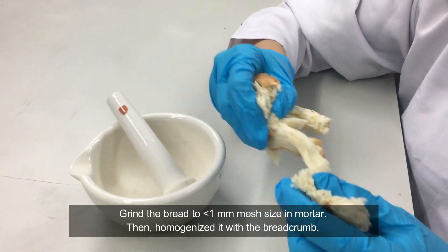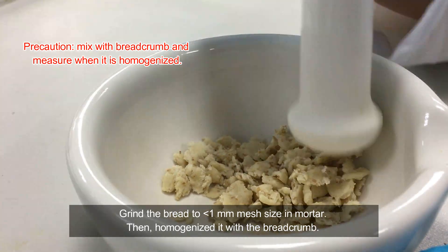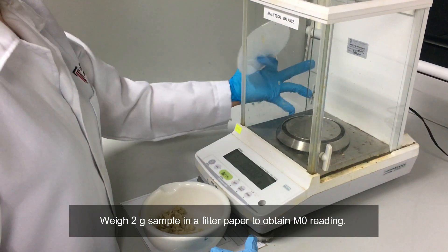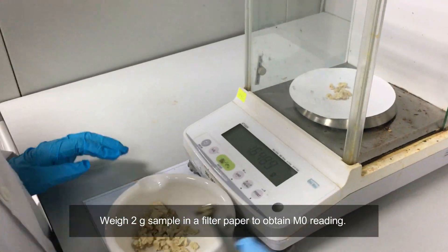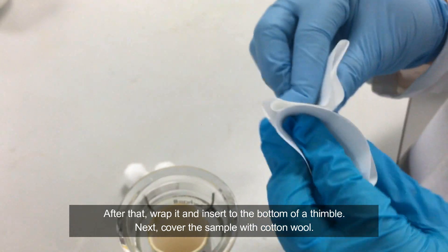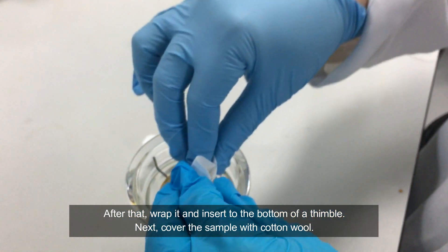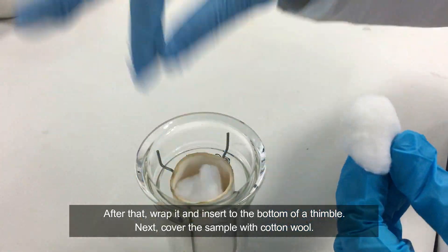Weigh the extraction beaker to obtain the M1 reading. Grind the bread to less than 1 mm mesh size in the mortar, then homogenize it with the bread crumb. Weigh 2g of the sample in a filter paper to obtain the M0 reading. After that, wrap it and insert it to the bottom of the thimble. Next, cover the sample with cotton wool.